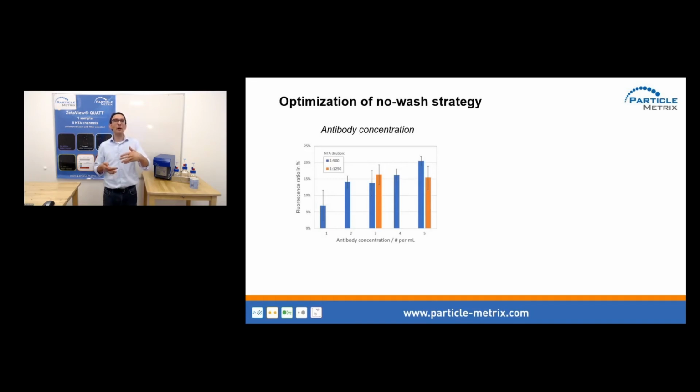free dye, and by increasing the dilution, we are getting back to the staining, so the pure staining, and not picking up the background. So once you do that, you can just increase the dilution, and by that you make sure that you are not affected by the background. So this is nice. So we have a stable kind. We found the optimum, the region of stability, we would say. So it's 3 microgram plus minus 1, which is quite nice. So you have a range.